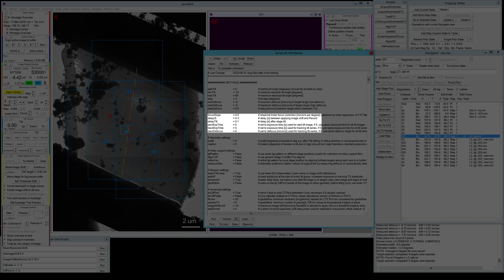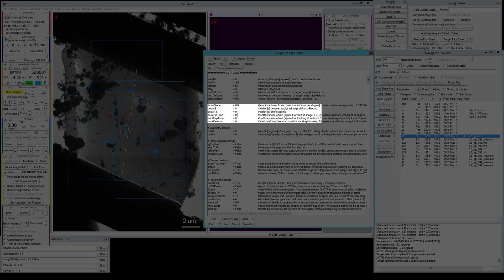You can set a delay after an image shift is applied or after the stage was tilted. This depends, of course, on the stability of your microscope. I usually keep it very low and I didn't see any detrimental effects of having low or no delay at all.